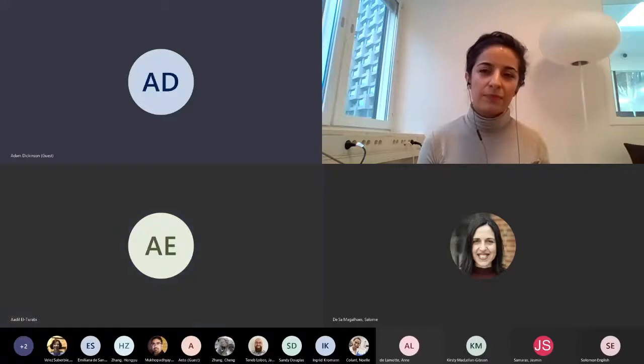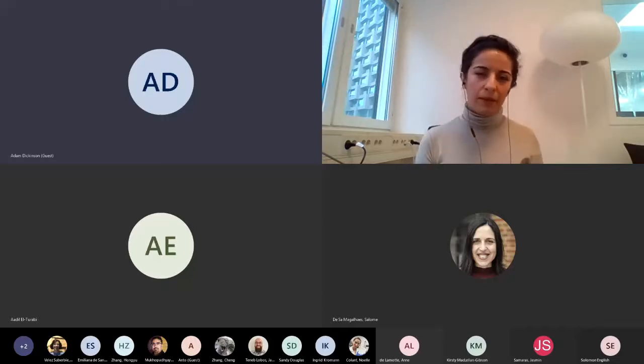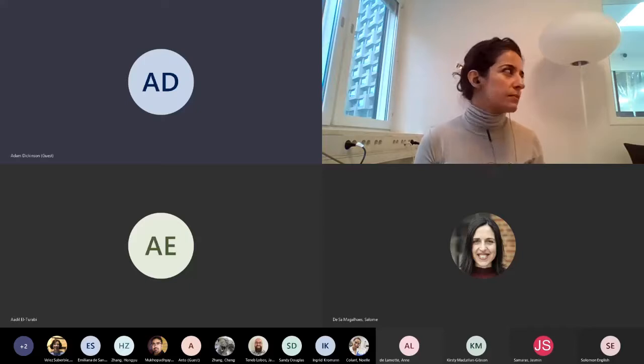Yeah, it is possible. I think we use OME-TIFF, Open Microscopy Environment, because that will contain the necessary metadata for our software to read those files. And I think there is a way to do that through ImageJ or Fiji, and then these can be imported into our software and looked at.